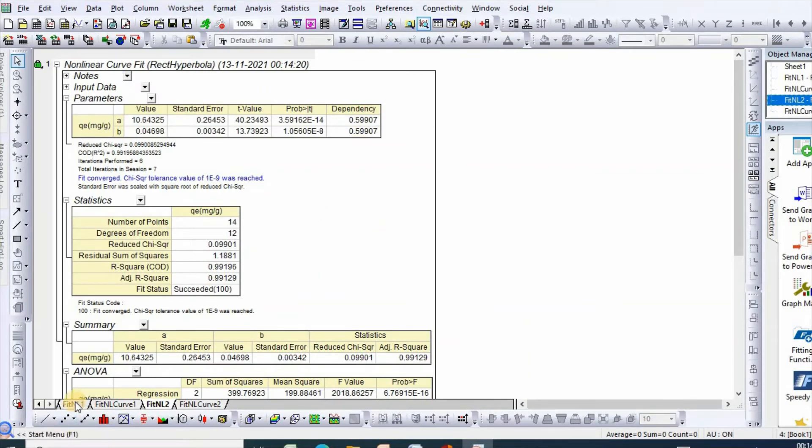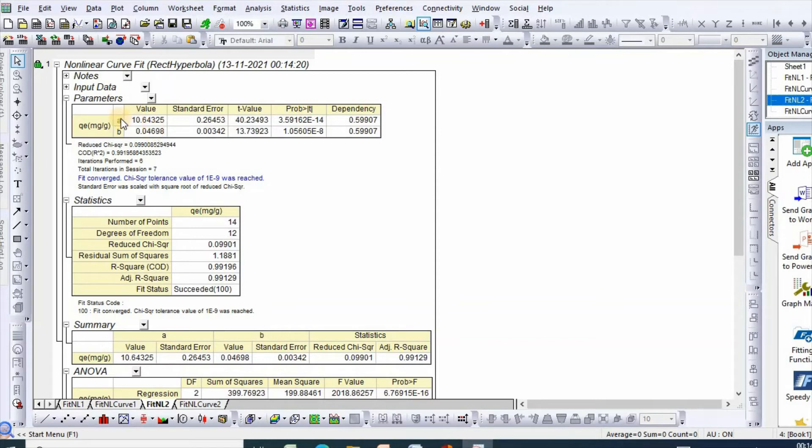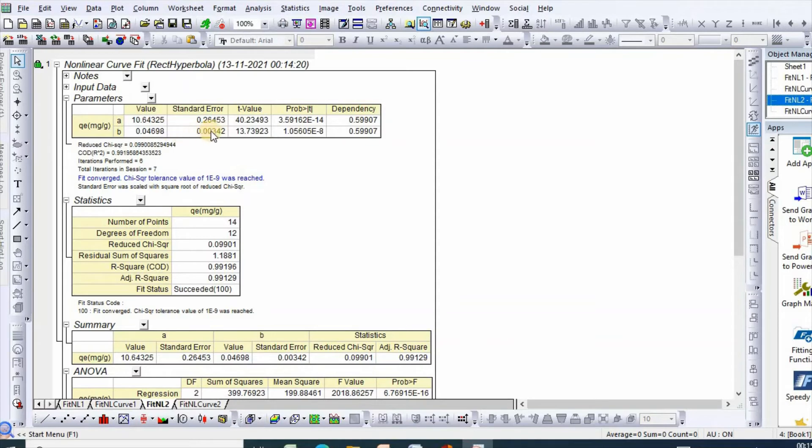Here are your nonlinear curve fit parameters. In the parameter section, you see A is the maximum adsorption, which is qm equal to 10.6, and standard error is plus minus 0.264. On the other hand, B is equivalent to Langmuir constant KL, with standard error plus minus this value.